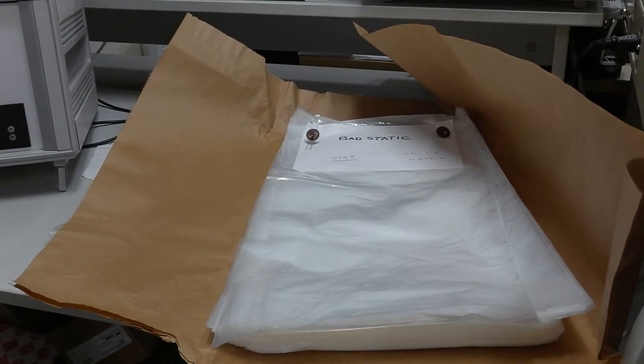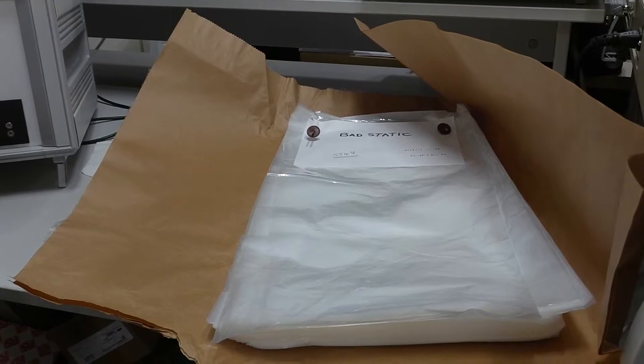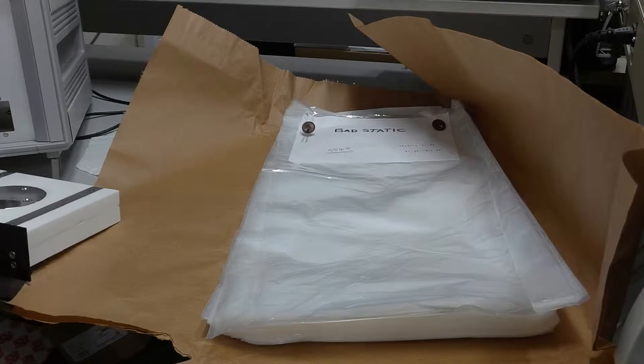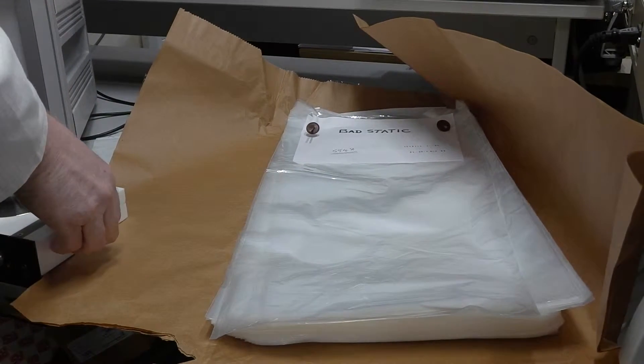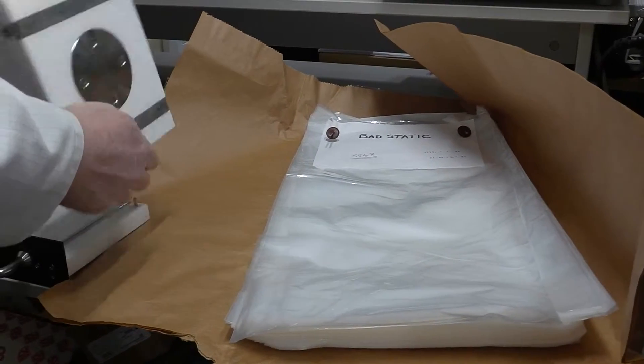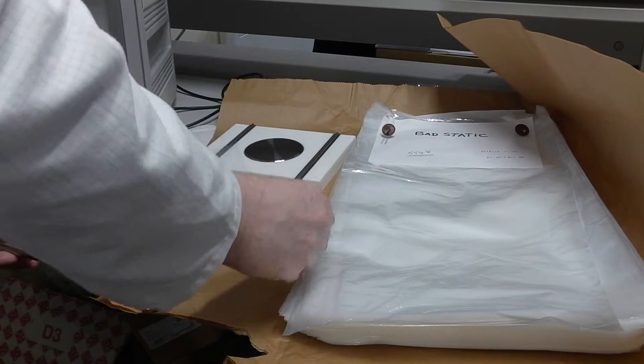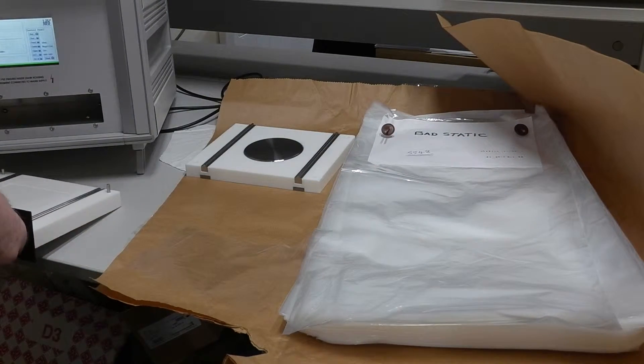What we'll do this time is prepare the sample. We'll remove the sample holder from the instrument and retrieve the previous one, taking care not to mix them up.